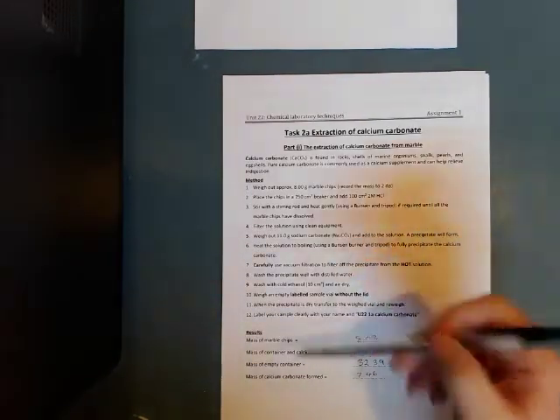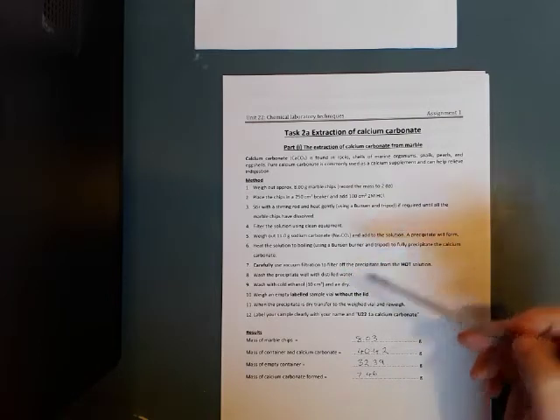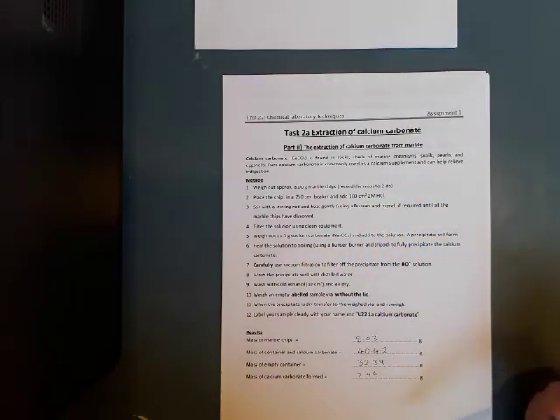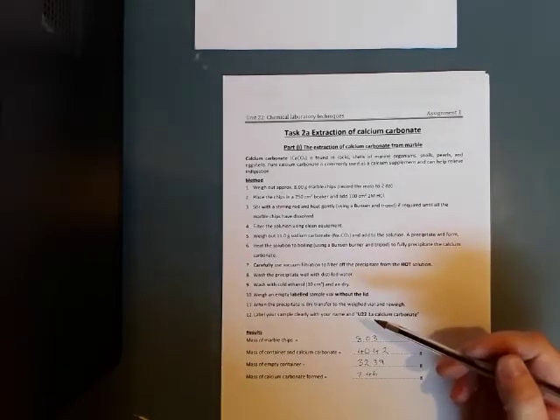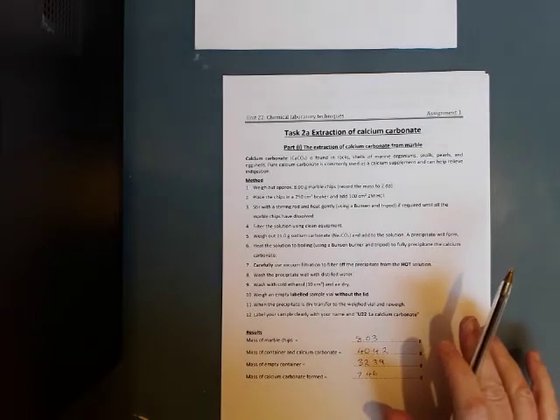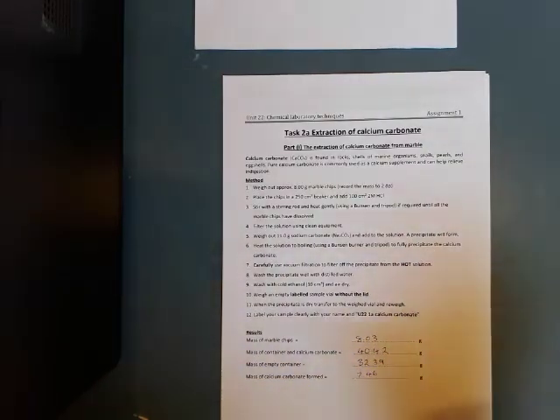So looking at how we could improve this, if we're going to use distilled water, maybe we use cold distilled water. Okay, because obviously as temperature drops, solubility decreases even more. So again, that's just something to think about.